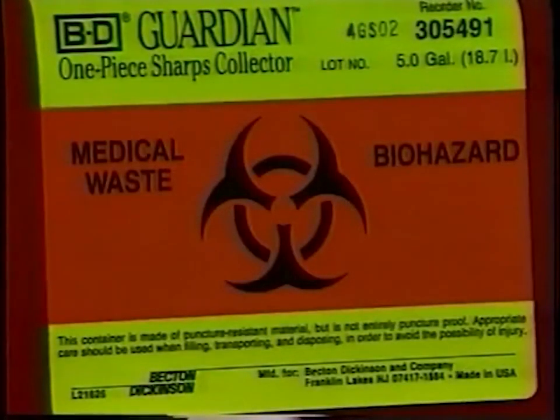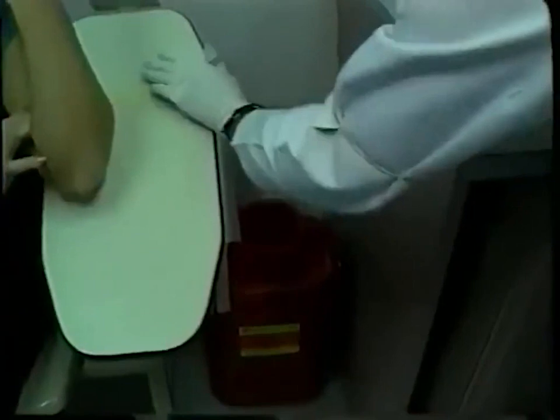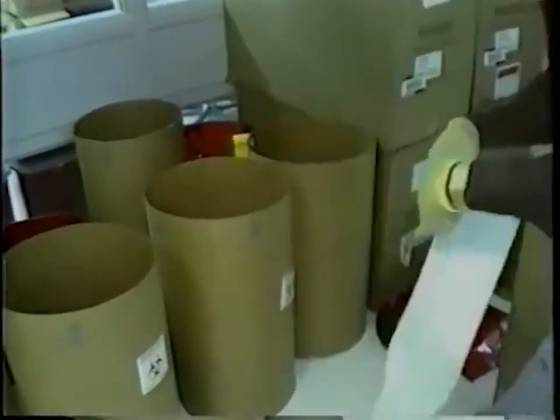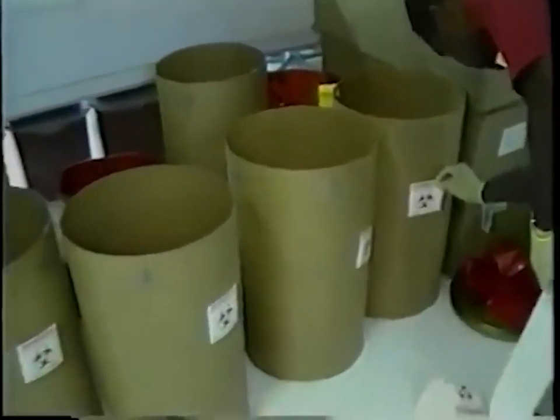It is extremely important not to overfill a sharps container. Generally, plastic sharps containers have a designated fill line. The reason for that is to minimize employee exposure and the chances of being stuck from needles or other types of sharps coming out of the container itself. Pressed fiberboard sharps containers must also meet the above standards.